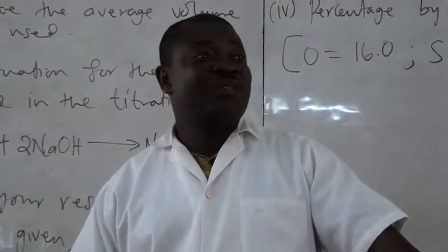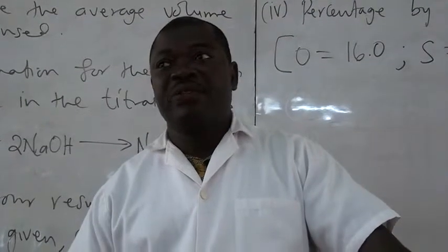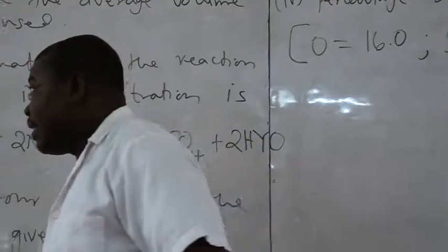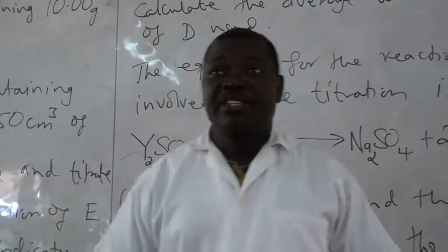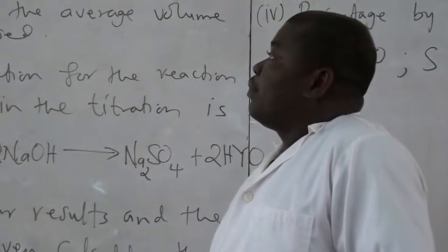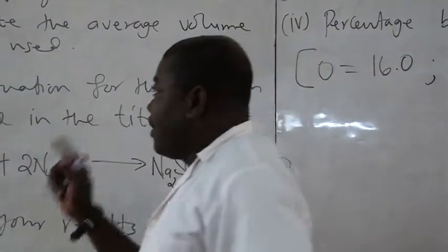Yeah, good. I think last week we took the alternative A of the 2013 chemistry practical. Do you remember that? Okay, and I said today we are going to look at the alternative B. So that is the question we have on the board. I put the question on the board with a bit of alteration.